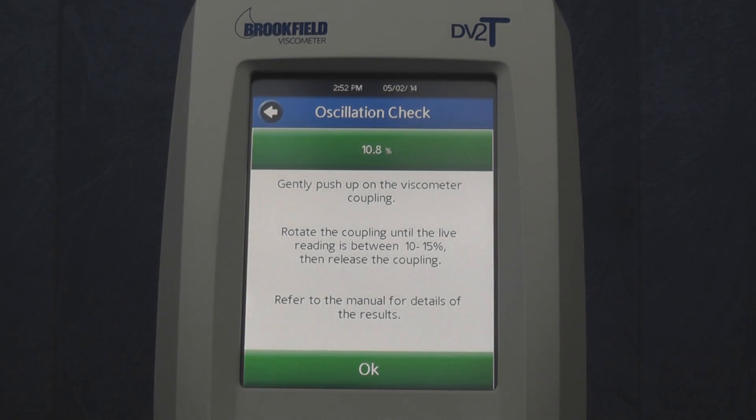Once you pass the 10% torque mark, the percent torque box will turn green, letting you know there is enough torque to perform the test. Once you let go, this box will turn gray. You should then see the torque drop quickly and then fluctuate around the 0% mark. It is normal to see negative torque values during this test.